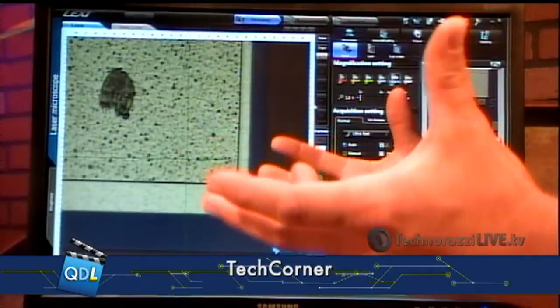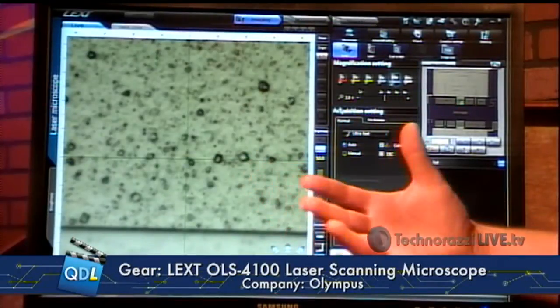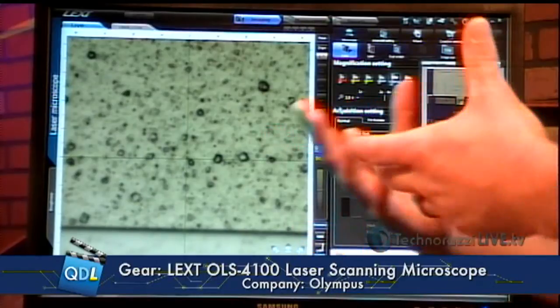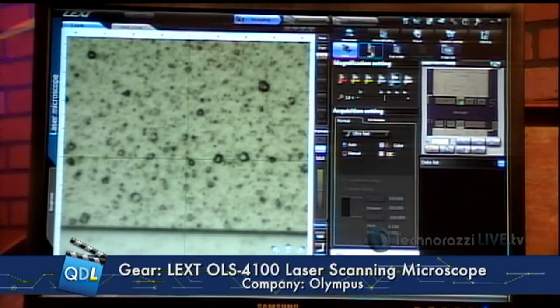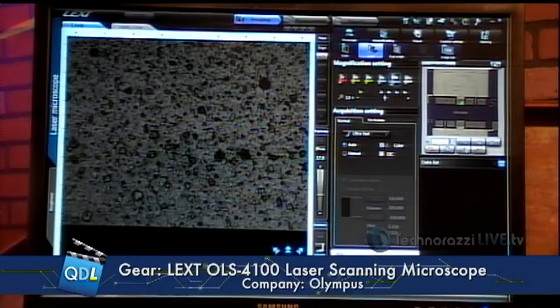Sometimes there's digital magnification where you simply stretch the image — but you're not necessarily seeing any more detail, just a little closer up. So if we take a look at our color image here, we can't stretch white light or make it scan, but we can digitally zoom it. And now you see the resolution drops off — the reason it drops off is the pixels can only cover so much, so you're digitally zooming and start pixelating the image. Compare that to the laser, which is going to have incredible resolution. And you're saying this is only 3,500 right now? About 3,500 times magnification. And you can go up to 17,000 — with the 100x lens, we can go to 17,280 to be exact. The white light and the laser light run through the same lens; the laser just has the ability to scan smaller areas and increase magnification.